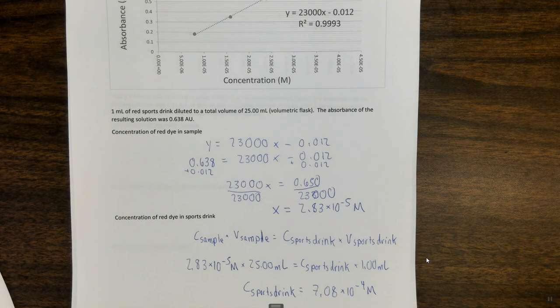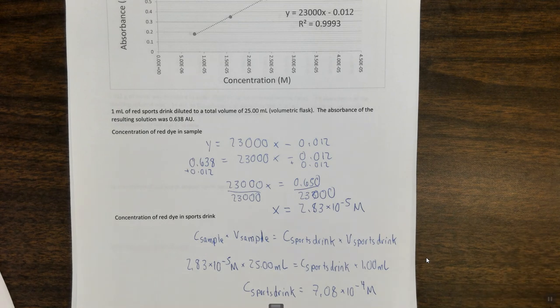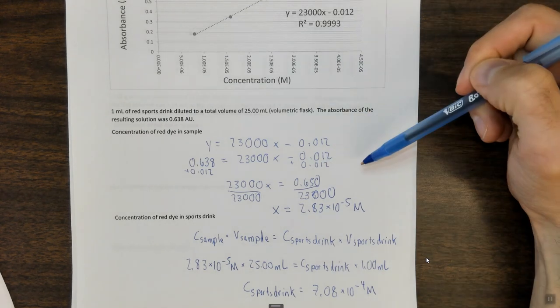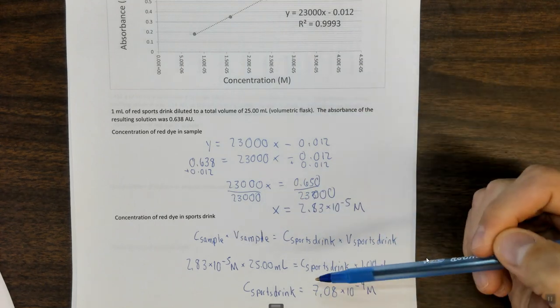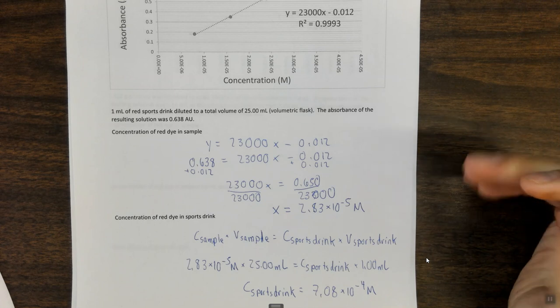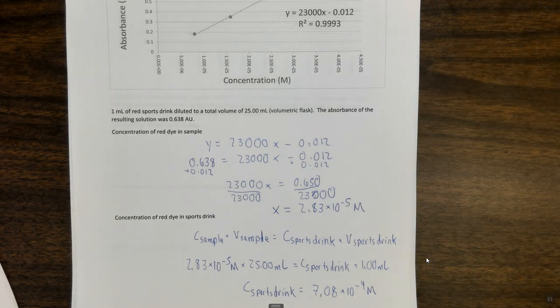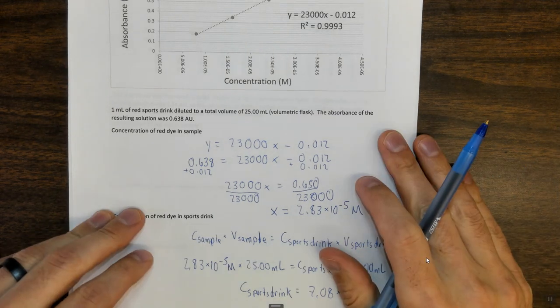1 in 25 may not work for you. You might have to do 1 in 10. You might have to do 1 in 50. You may have to do it twice, right? You might have to dilute it 1 in 25, and then it's still way off the calibration curve, and you have to dilute it 1 in 25 again. So you have to do this math twice. This is not exactly what you're going to do. It's not meant to be exactly what you're going to do. It's just meant to give you an idea of how this experiment is going.